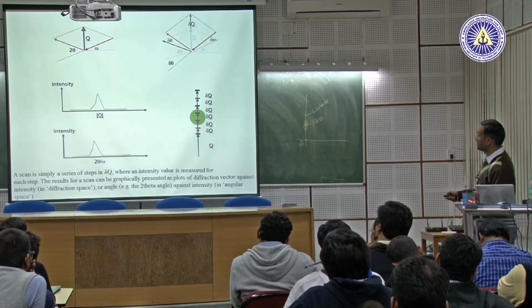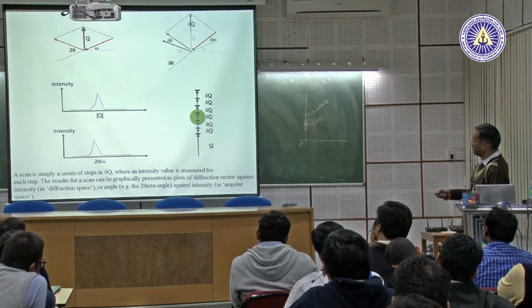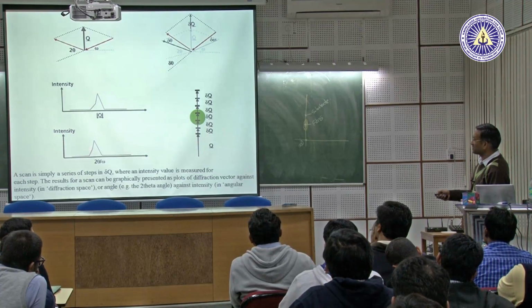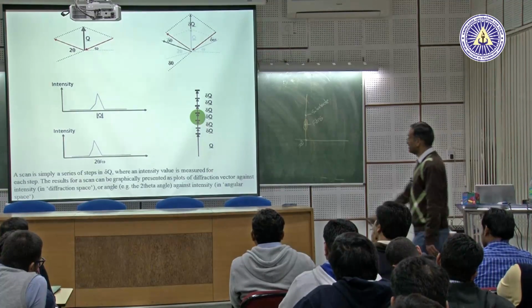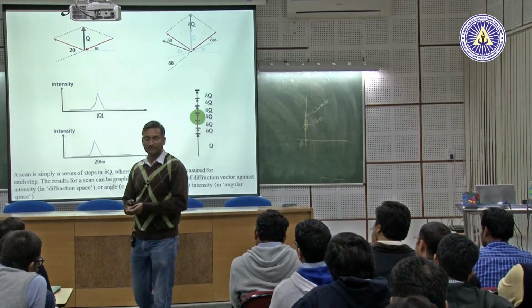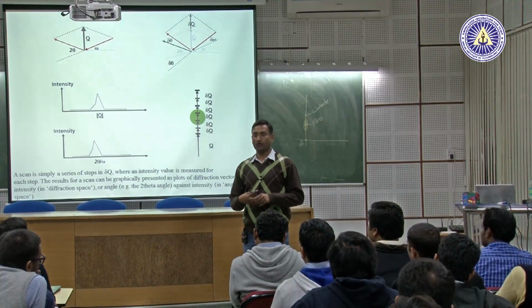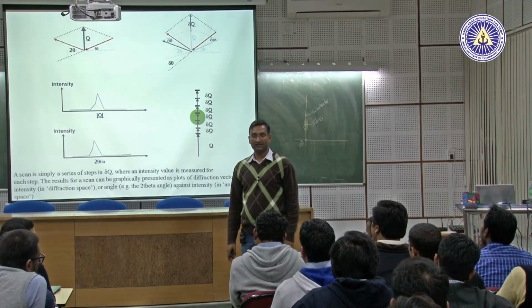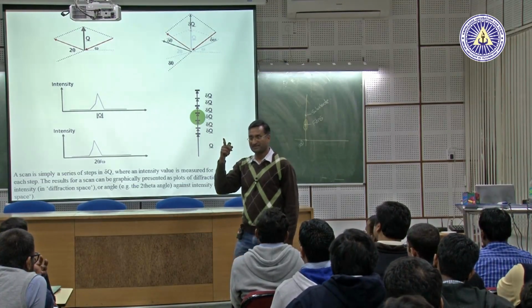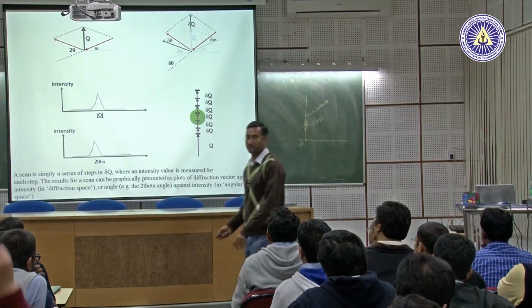So, what you are recording basically is a 2 theta omega coupled scan, where you measure the changes in the intensity with slight variation in the 2 theta omega. If it was a perfect crystal, what would you expect? You will expect a single line, right? But since crystals are not perfect, they have strains, they have various other defects with them.